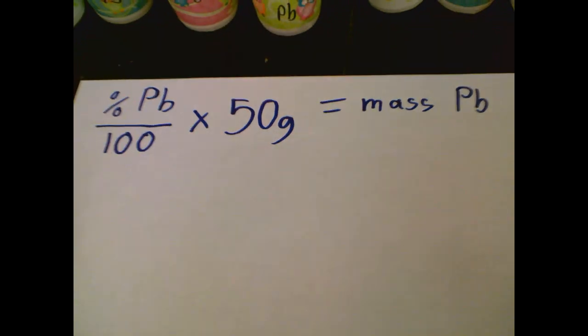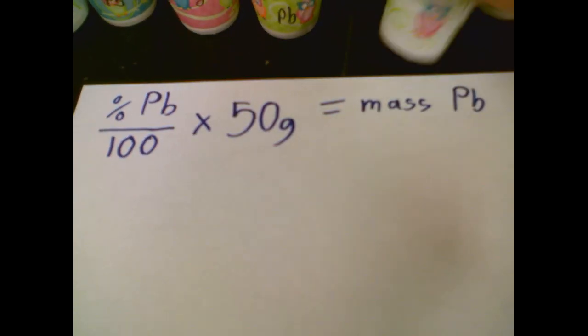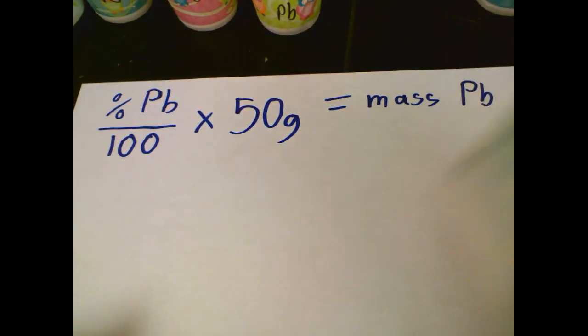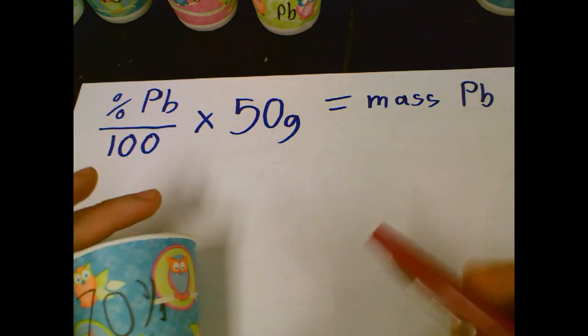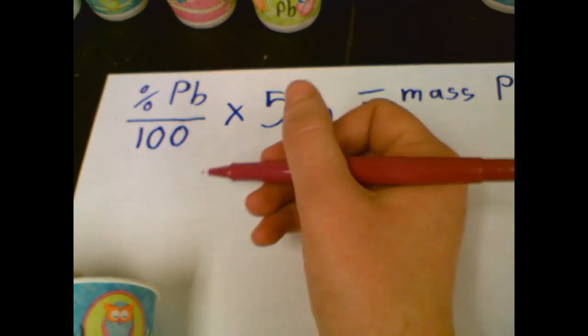So let's pick a random one here. Sure, 40. No, I just did 30. 70. So for 70, let's make color codes.